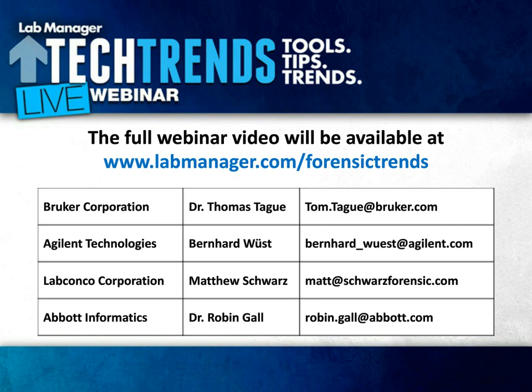Excellent, thank you. And while I have you, how's the performance of IR or Raman when you're dealing with mixtures? So usually, if you have a mixture of a few different components, you can use microscopy to try and collect an isolated spectrum of each component, but sometimes it's easier just to collect the overall spectrum and do a multi-component search, and then you'll get each component very nicely. So it just makes your job easier. Sure.